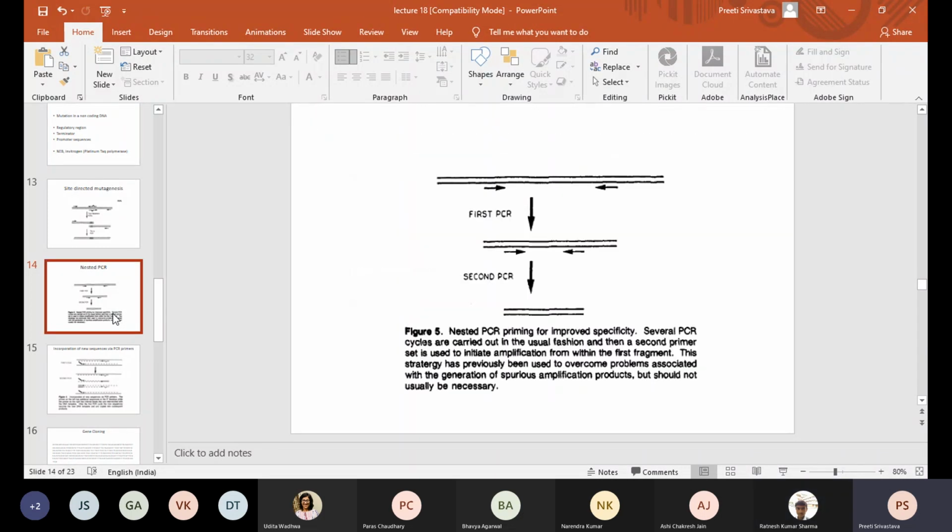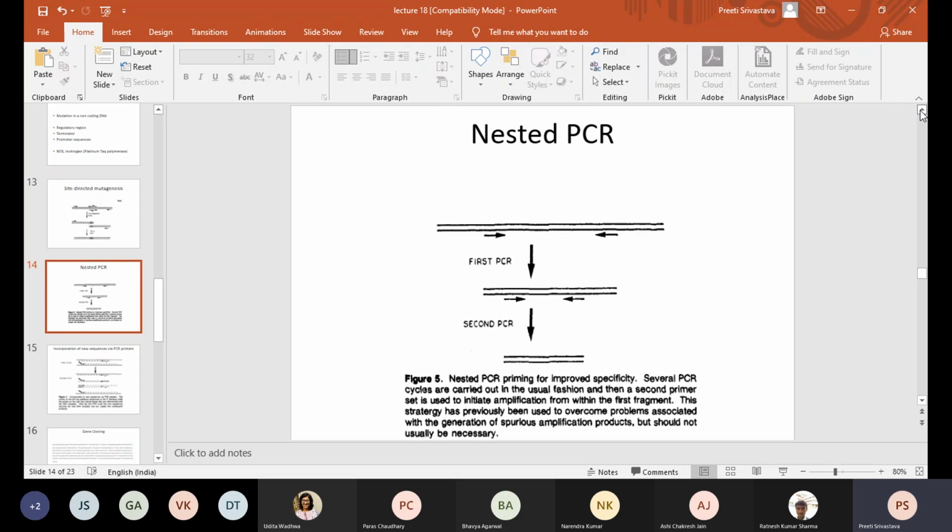Yes. Okay, so this is overlap extension PCR. At times another variant of PCR is called nested PCR. Nested PCR is done when sometimes the amplification is very weak, the amplification is less. In this case, you perform a first PCR reaction. For example, you select a primer which binds at a faraway distance, and then use this as template and design internal primers, right? So you get an amplicon after the first PCR, and then you use that amplicon as the template and then use internal primers.